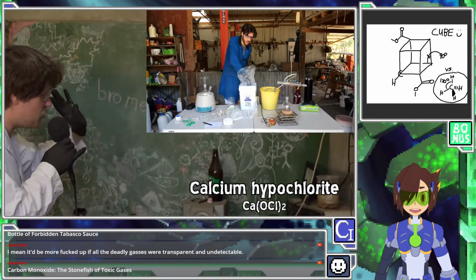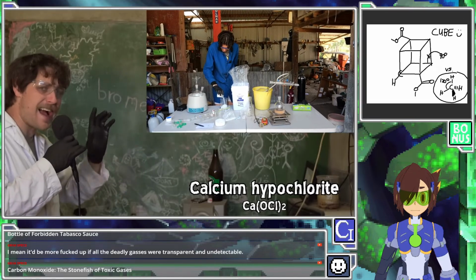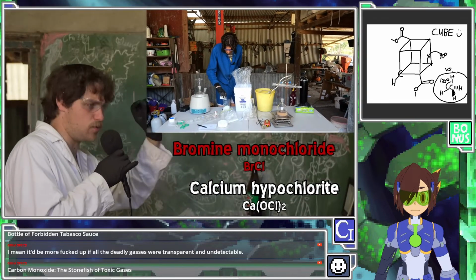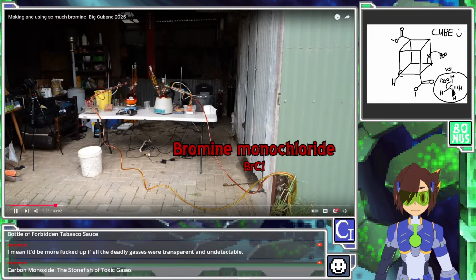This is a strange choice because generally people avoid chlorine-based oxidizers because you can make this interhalogen compound BrCl. So it's one bromine and one chlorine. Which, as I'm sure he's about to explain, chlorine and bromine gases on their own are very reactive and bad for you. The interhalogens that are just one halogen bonded with another halogen are often also explosive and unstable, as well as being extremely toxic and corrosive. It's a very bad idea. And that is pretty much a gas.